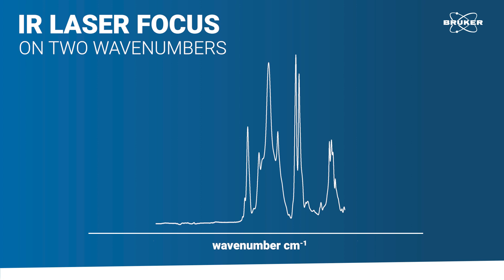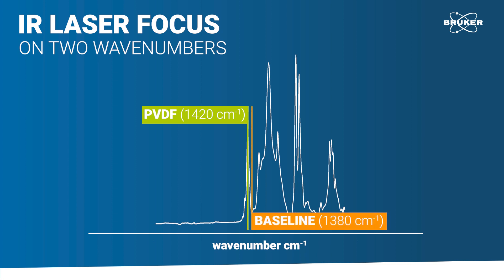Let's take a look at the spectra of PVDF in the key spectral range. Here, we select one characteristic PVDF peak at 1420 wavenumbers and another at 1380 wavenumbers representing the baseline. Now we can start the measurement.